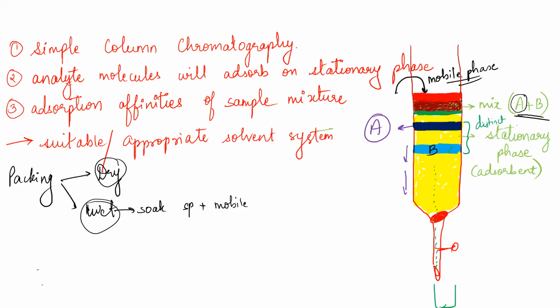Okay, so as your analyte moves, first, how was it? It was just a band of green color. This was the mixture that you loaded on the column. So I'm going to show you only the mixture. Now focus. Okay, concentrate on this. Now you have added the mobile phase. The mobile phase will pass through it. Then in the next 2-3 stages, what is going to happen? A little separation you are going to see, and you will see like this. This is my A analyte, and this is the B analyte. This is, say, in the second phase of separation.